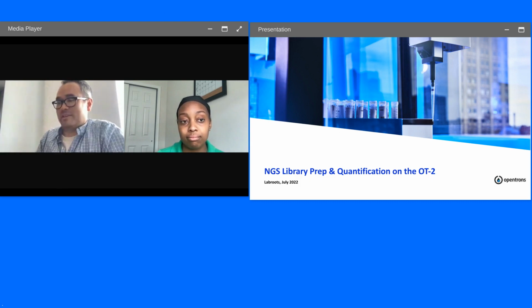I just have one more note, thank you for going through all the protocol. My big suggestion is, once you have a kit or protocol in mind, to follow their recommendations. The workflow I presented was a generic basic template for a lot of people to get started.